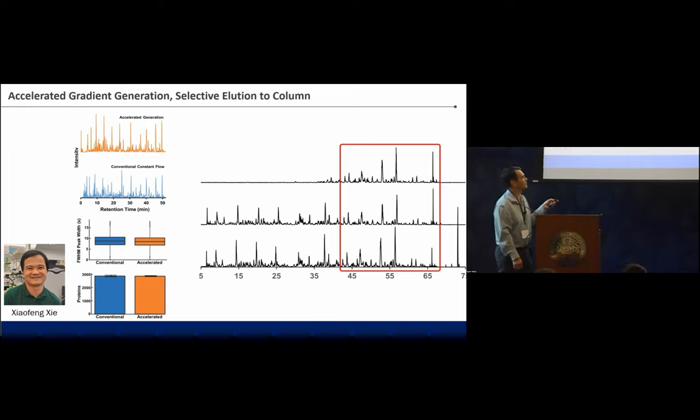Wonderful talk. Thank you. So in the slide where you show the 20 nanoliter flow rate that you have, you didn't reach 100% duty cycle. I'm a little curious, what exactly is stopping you from accelerating the flow rate at the very beginning? You don't have any peptide there. You don't need low flow rate to maintain sensitivity. Just accelerate it and then make sure that when peptide elutes, you have 20 nanoliters coming out of the needle. So why not just accelerate when nothing of interest is eluting, and then drop your flow for your analysis? Is that what you're saying?